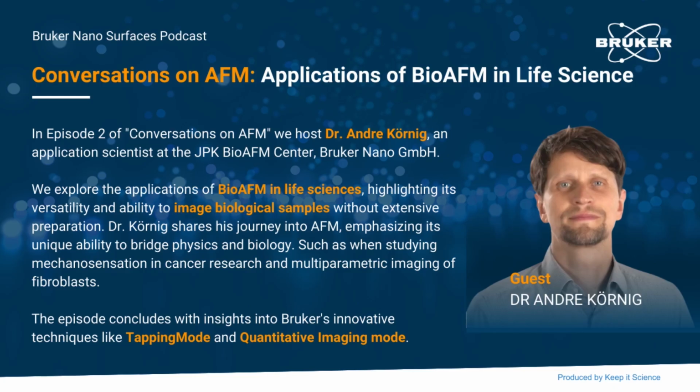What people do now is, because this Hertz model is quite simple, it has a lot of assumptions that actually don't apply so much to the biological world. But now we also have, and I think this is highlighted in this ebook, a so-called microrheology tool. So we do not only poke it, but move the cantilever a bit up and down, and see how your sample reacts to it. If it's only elastic, it would react differently than if it's viscous. So then you have a small drag. This is a parameter you can also get out of it.